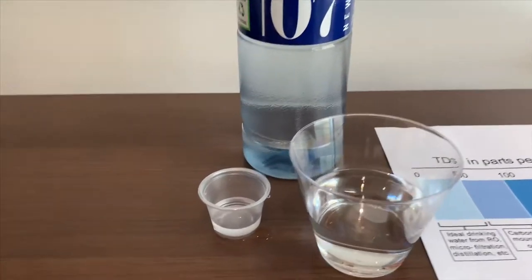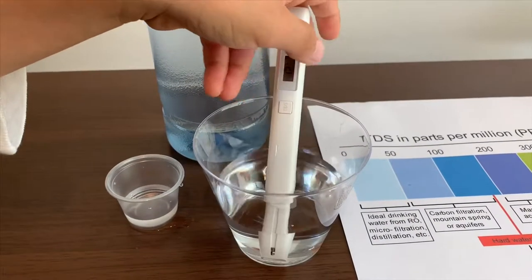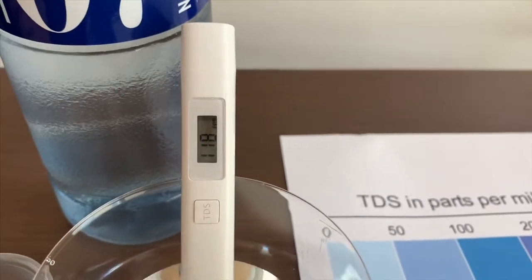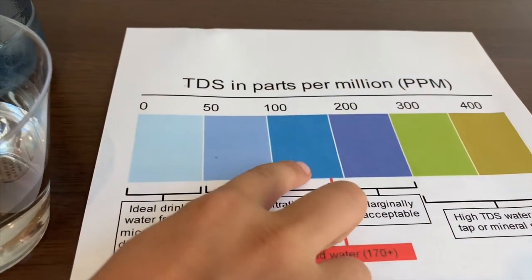Turn on the TDS tester. Make sure it says 0 and put it in. It is 118. That is okay water.